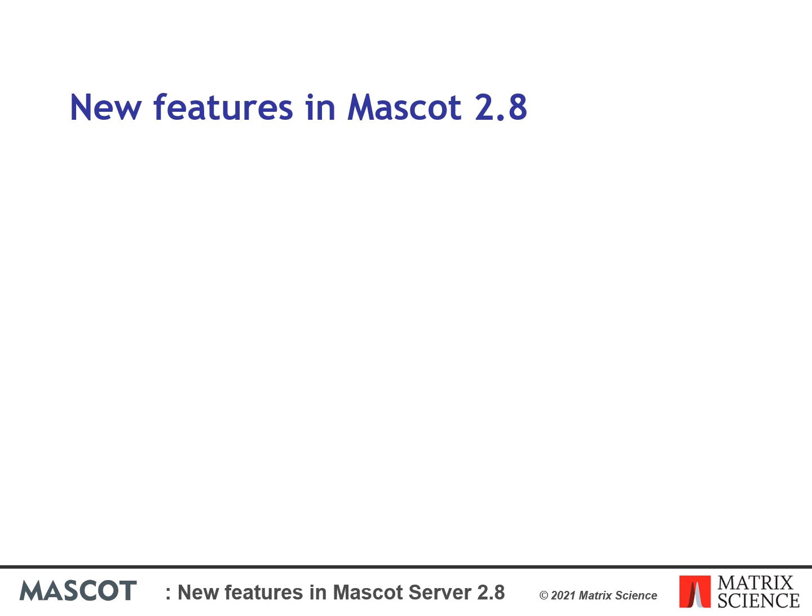Mascot Server 2.8 was released in July 2021. Here's a summary of the new features and significant changes.